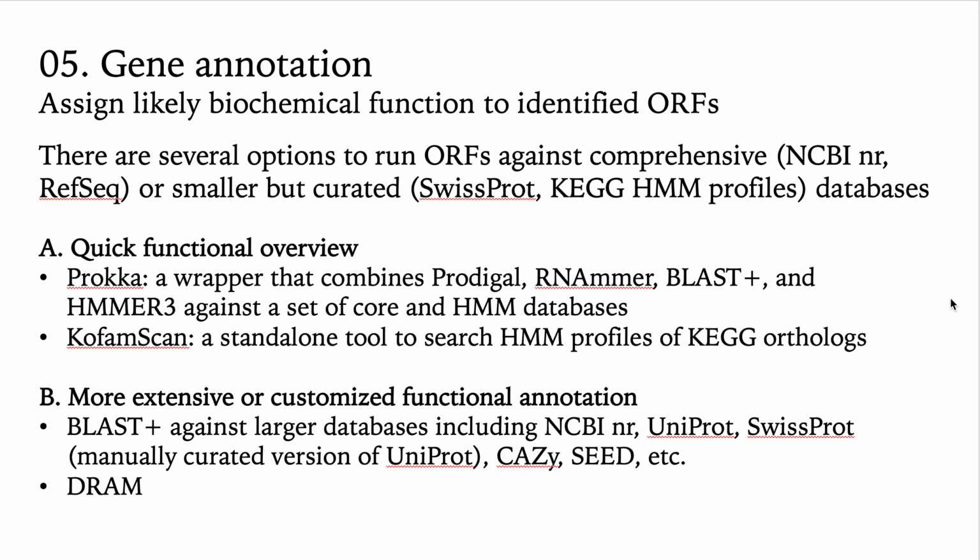So then you take your representative longest sequence from your clusters and run them against your database of choice. This is a really vast and complicated part of the pipeline, and I'm not going to go into deep detail. I will divide it into two goals. If you want just a quick functional overview, you have a couple options. But if you really want to dig deep and be extremely thorough and extensive in your annotation, you have a couple more options that will take longer, but give you more information.